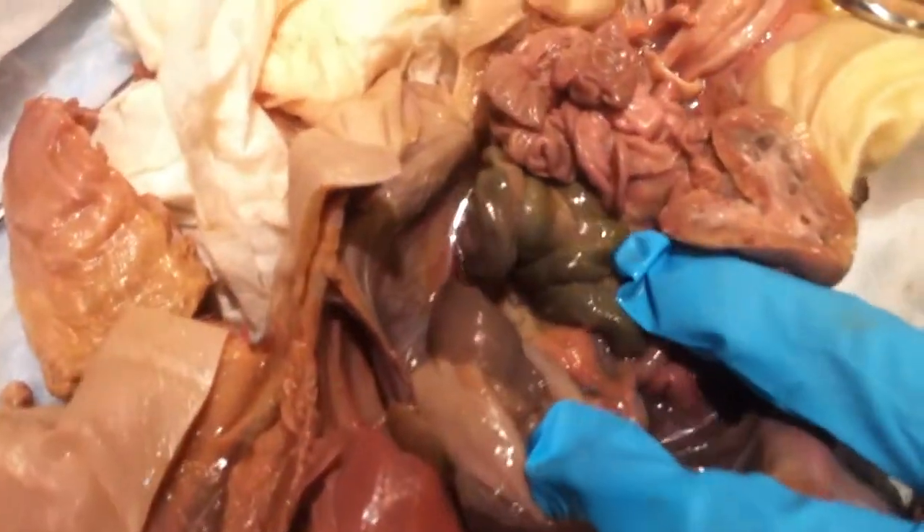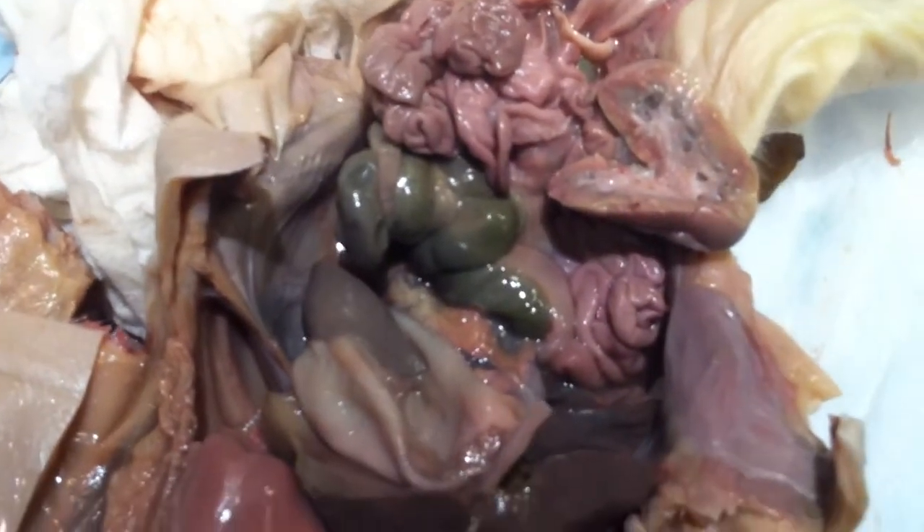What is it again? The pancreas. The pancreas is regular. They look like white grainy.